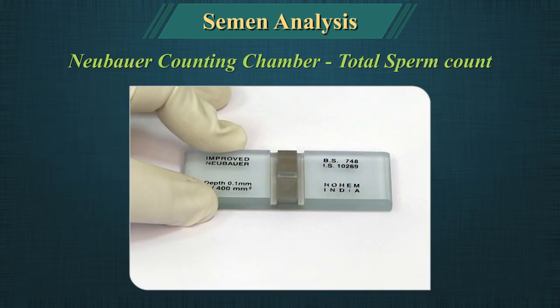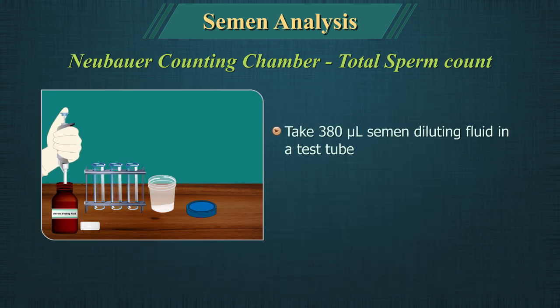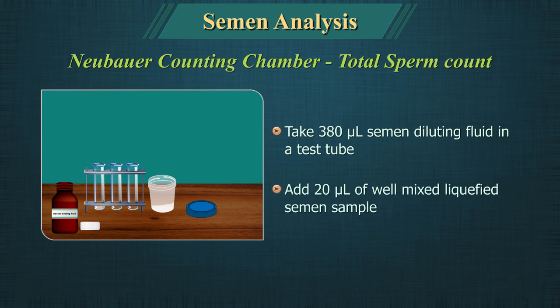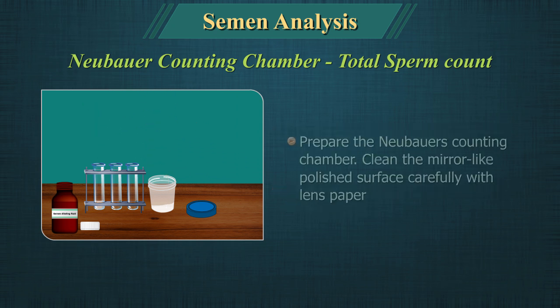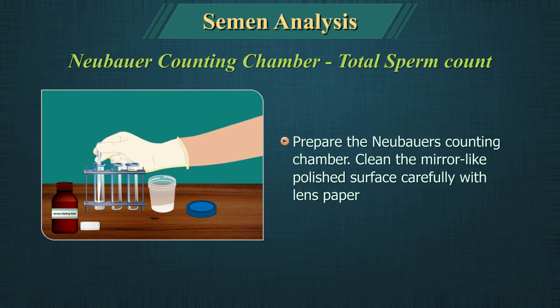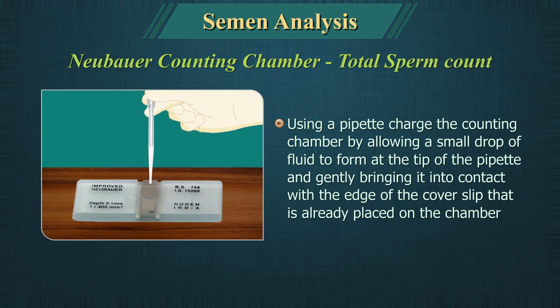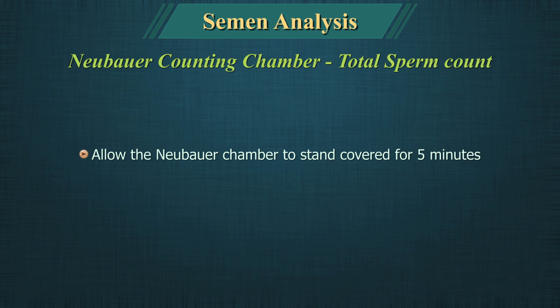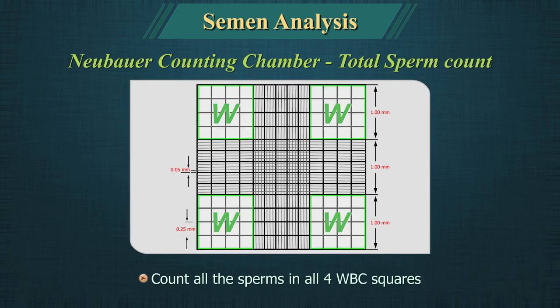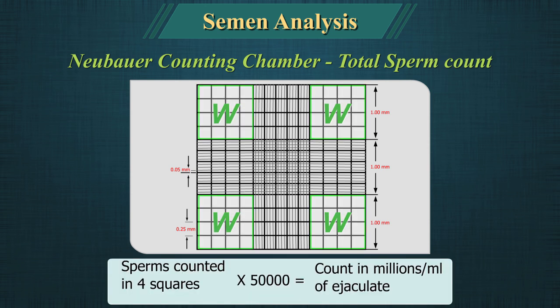Total sperm count using Nubar's counting chamber: Take 380 microliters of semen diluting fluid in a test tube and add 20 microliters of well-mixed liquefied semen to it. Prepare the Nubar's counting chamber by cleaning the surface carefully with lens paper; the cover slip should also be cleaned and placed over the counting surface prior to adding the cell suspension. Using a pipette, charge the counting chamber by allowing a small drop of fluid to form at the tip and gently bringing it into contact with the edge of the cover slip. Allow the chamber to stand covered for 5 minutes, then count all sperms in the 4 WBC squares. Sperms counted in 4 squares multiplied by 50,000 gives the count in millions per ml of ejaculate.